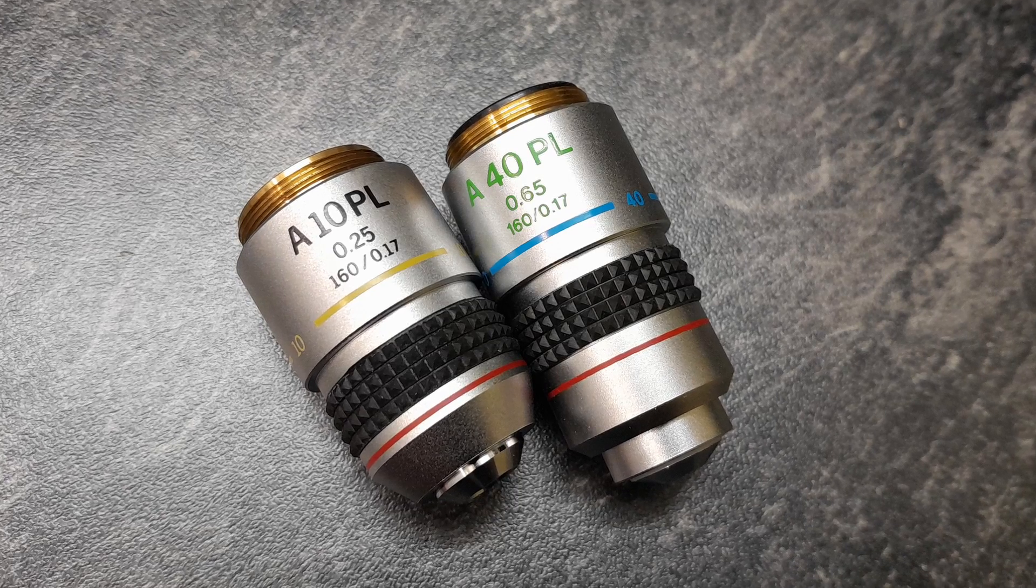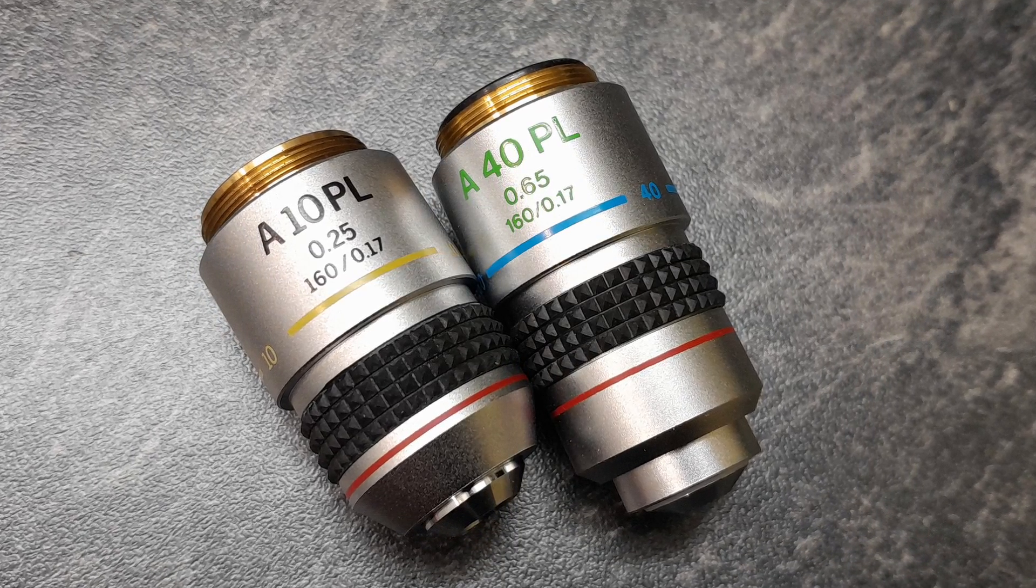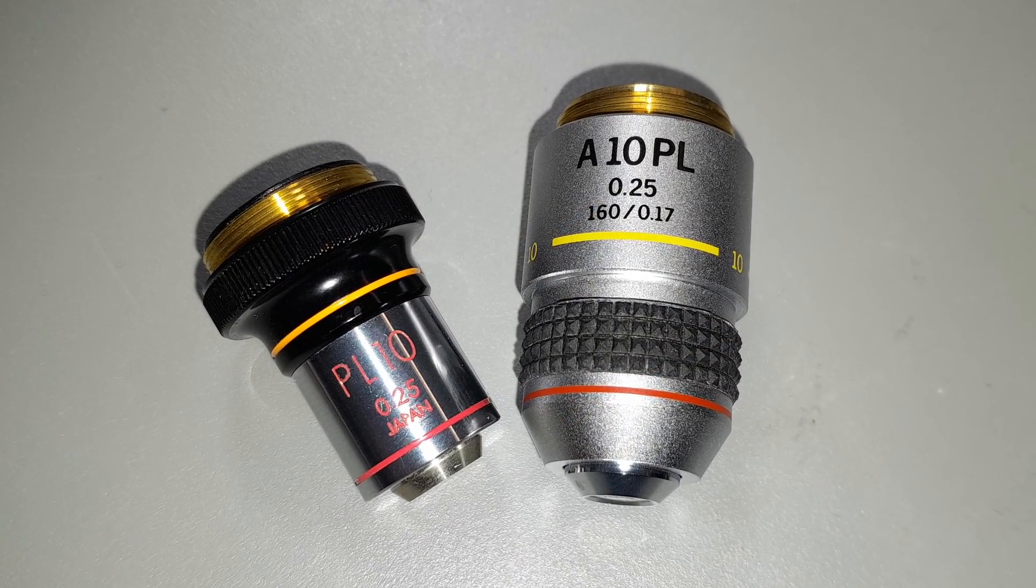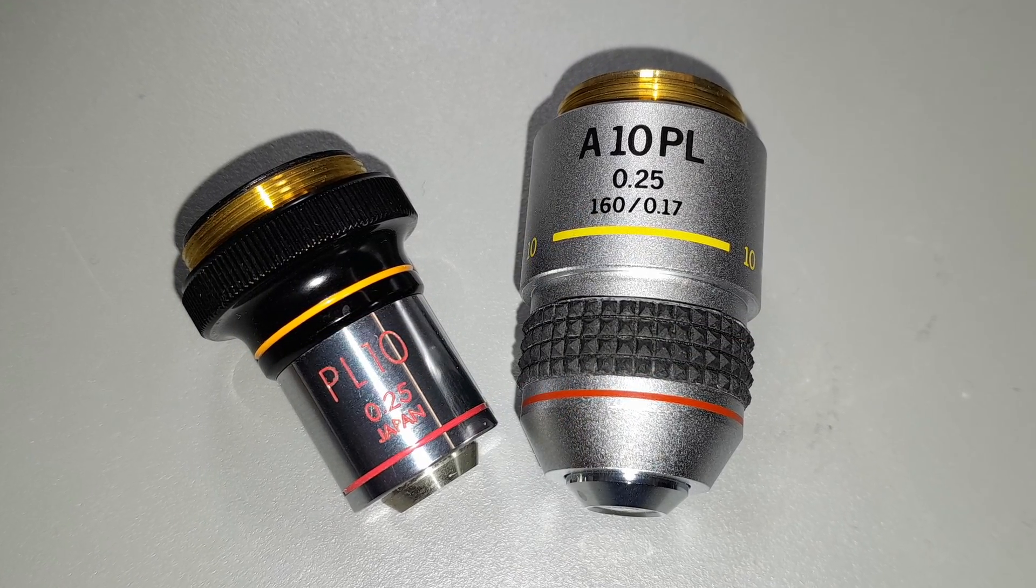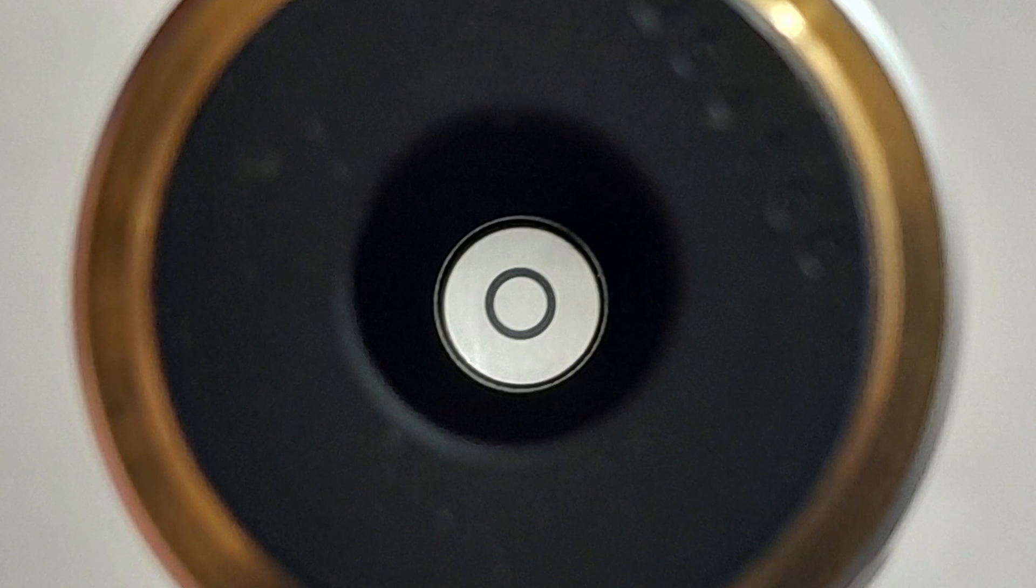So these here are two phase contrast objectives. You know that they're phase contrast because of the designation PL, which stands for positive low. Here, although two phase contrast objectives, the left one is old, it's from the old Olympus systems, significantly smaller and the other one is the new one.